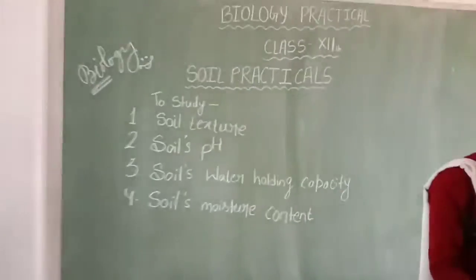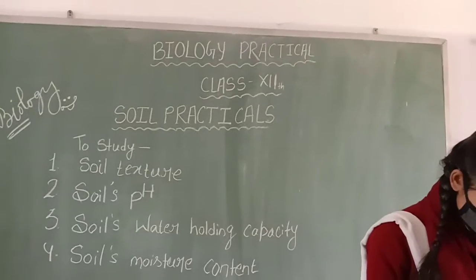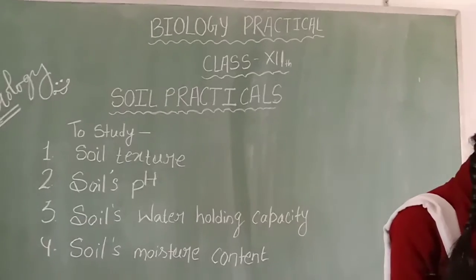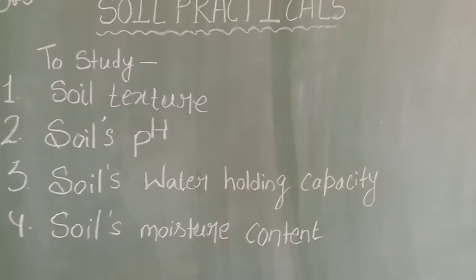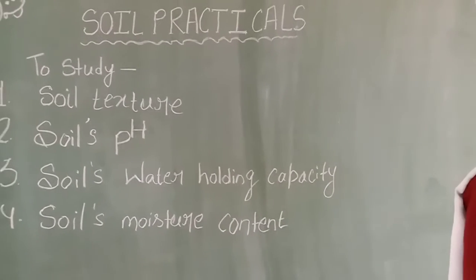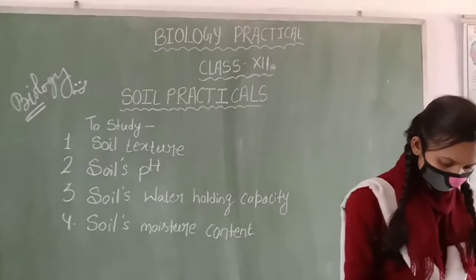The topic of today's experiment is related to soil practicals. Today, back to back, we'll do 4 experiments. First of all we'll see the soil texture, after that the soil's pH, and the third experiment we'll study is the soil's water holding capacity, and after that we'll go through the last experiment to see the soil moisture content.